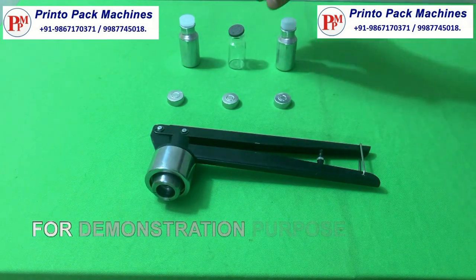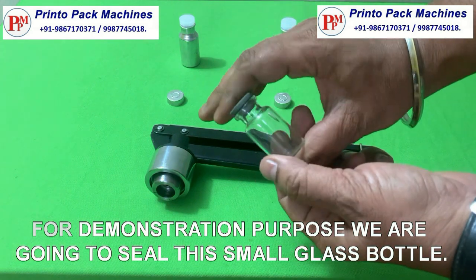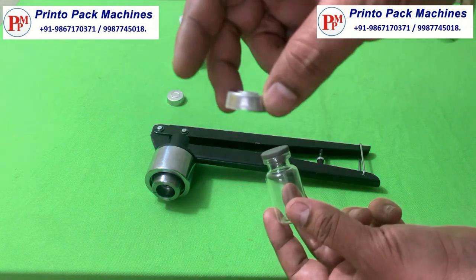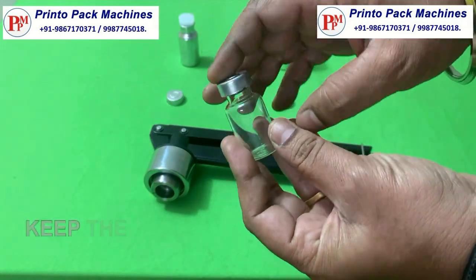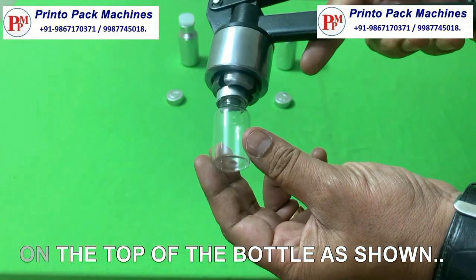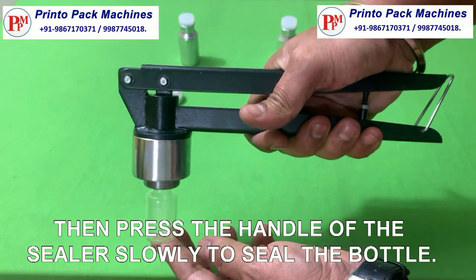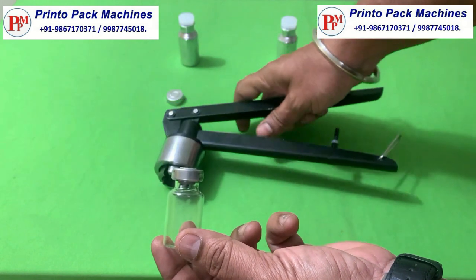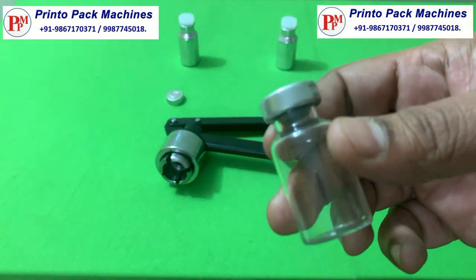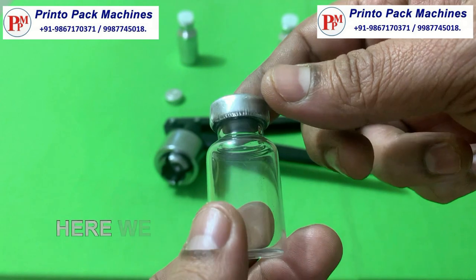For demonstration purposes we are going to seal this small glass bottle. Keep the aluminum vial and sealer on the top of the bottle as shown. Then press the handle of the sealer slowly to seal the bottle. Here we can see the bottle is sealed properly and perfectly.